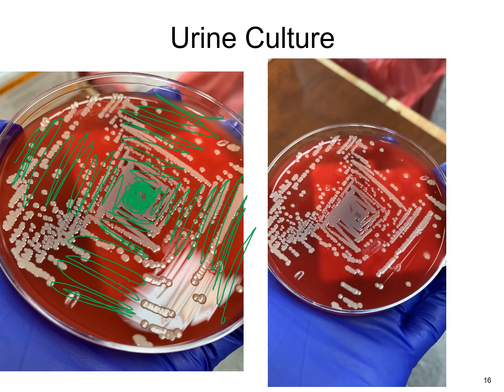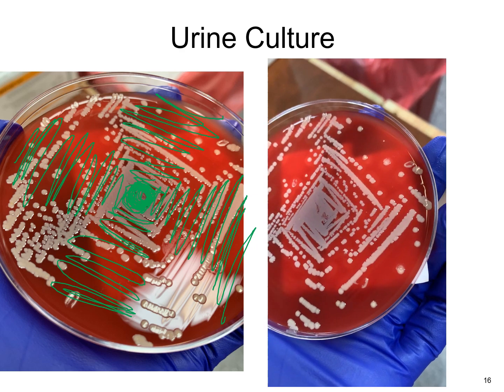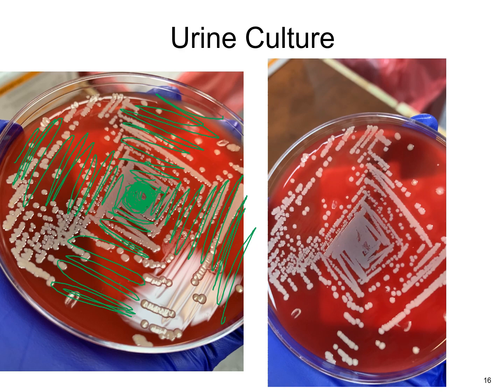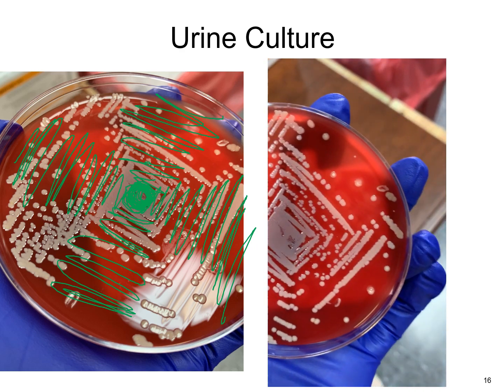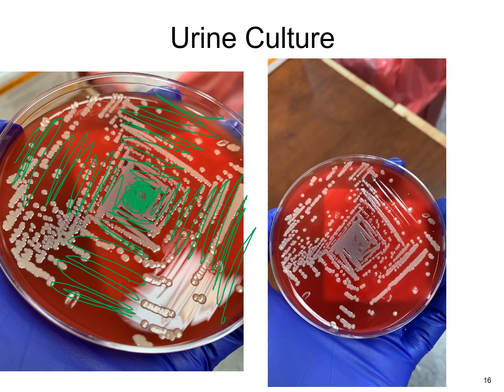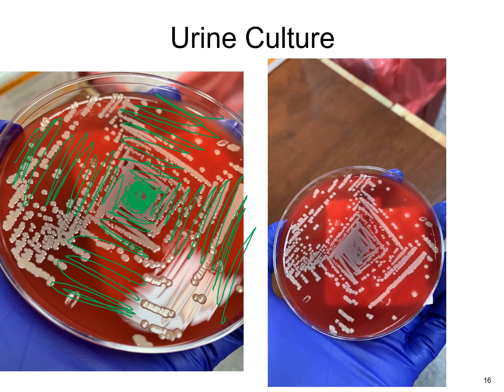And so with this video here, you can see as I tilt the plate some of those streak marks, where you get a little indentation on that agar without cutting it, and you can see how those colonies grow within those streak marks.